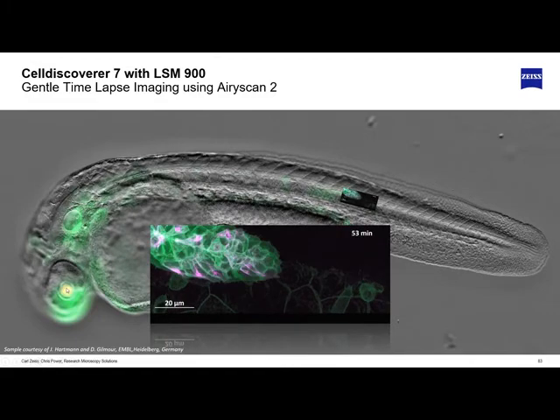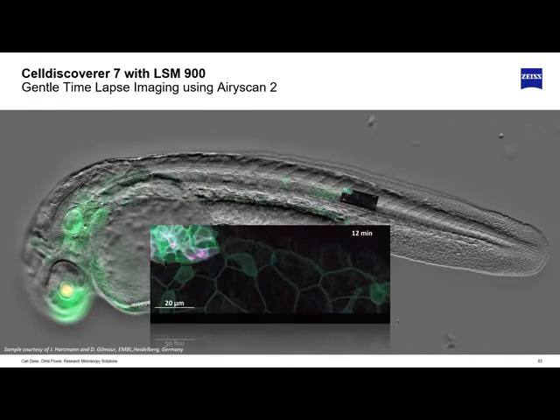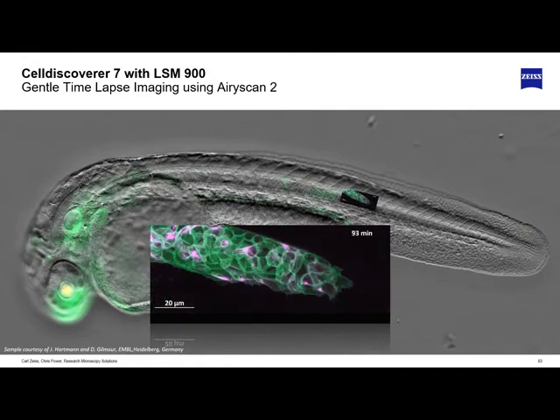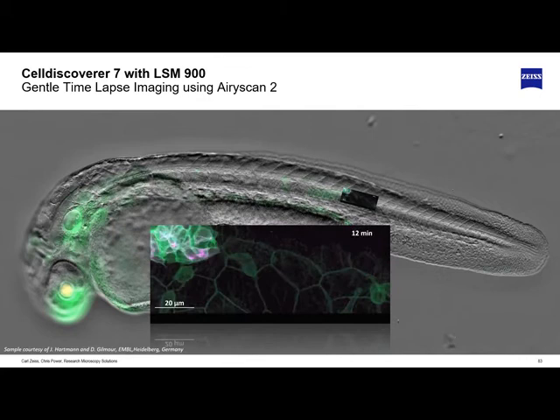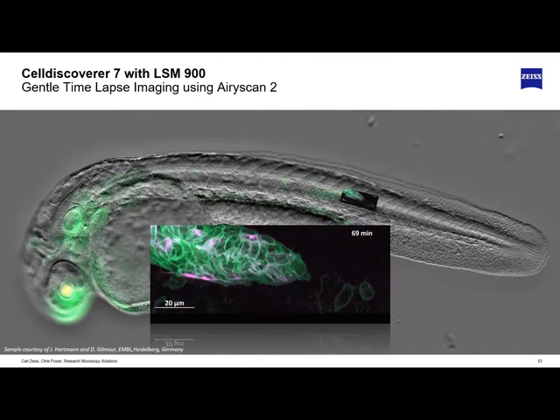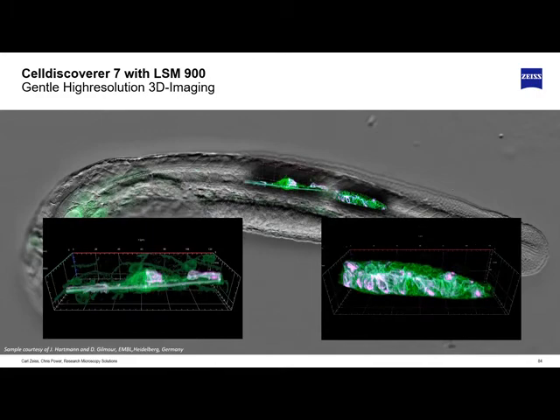Here we go. I hope you can see this. Okay, so yeah. Experiment Designer lets you not just run one experiment, but run experiments in multiple positions over time. Let's see if PowerPoint's happy still. Okay.